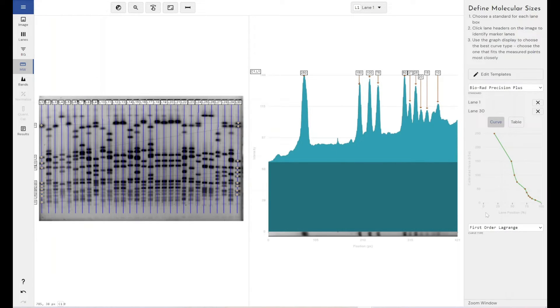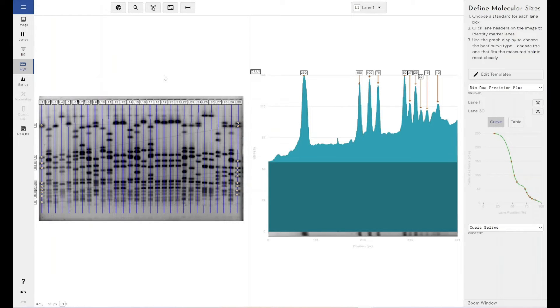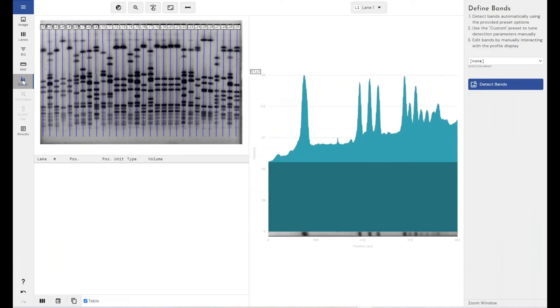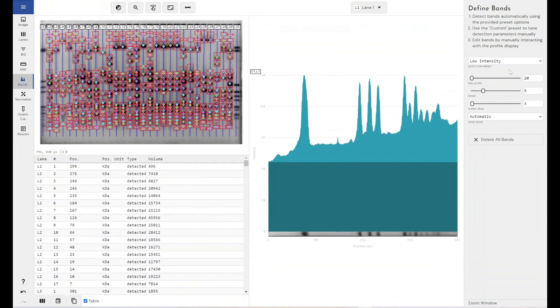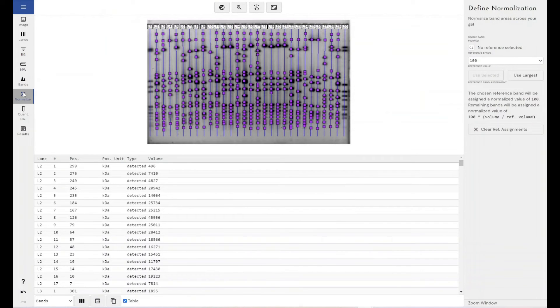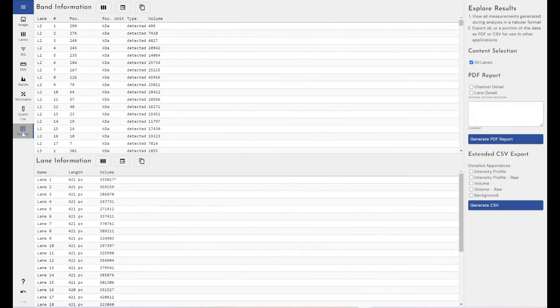It doesn't particularly matter what I put in as my curve type, but whatever you put in as your curve type, it will be remembered. Wherever you've defined your molecular weight lanes, they will be remembered as part of the protocol. Everything I'm doing here is included in the protocol. If I want to detect low intensity automatic bands, let's go for that. I'm not going to do any normalization or quantity calibration. I'm going to come through straight to results.